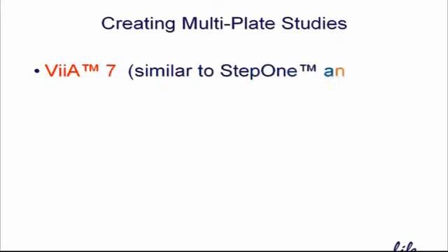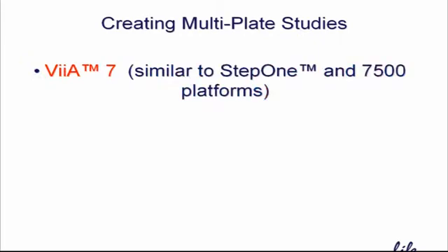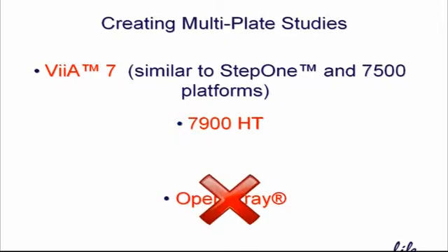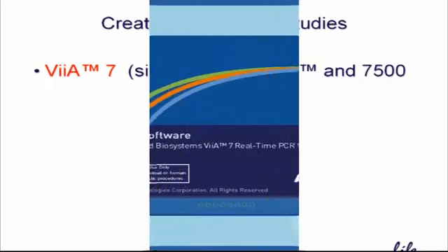Study files ensure that thresholds are equivalent for each assay across every plate in your larger experiment. In this video, we'll see how to create a multi-plate study on the ViiA 7, StepOne and 7500 instruments, and on the 7900HT. Note that the BioTrove OpenArray instrument does not require us to take this additional step. We will see toward the end of the video how to export final data out of the OpenArray for use in DataAssist.